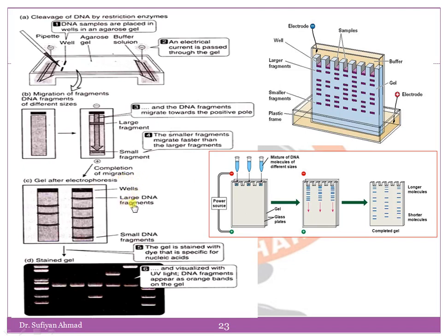To visualize DNA or RNA, the gel is placed on a UV transilluminator. Be aware that DNA will diffuse within the gel over time. Examination or photography should take place shortly after the cessation of electrophoresis.